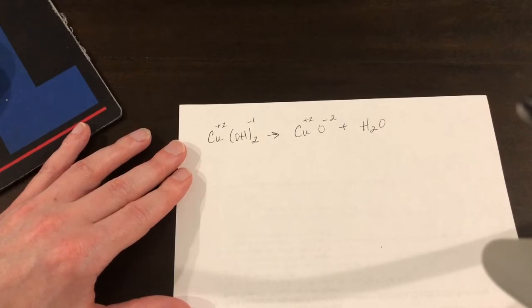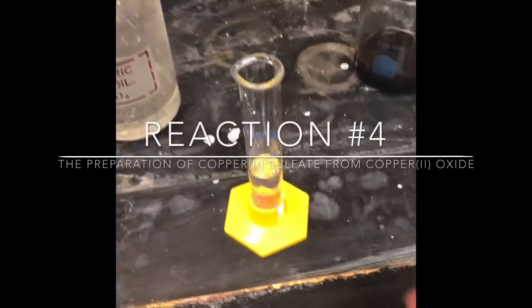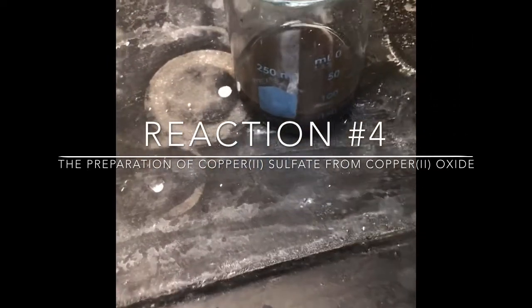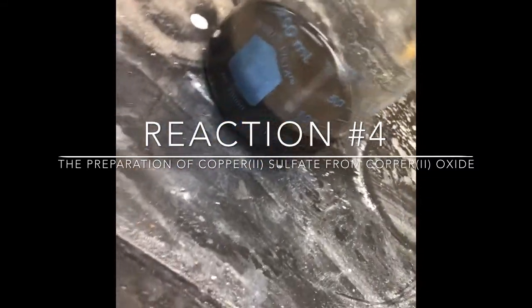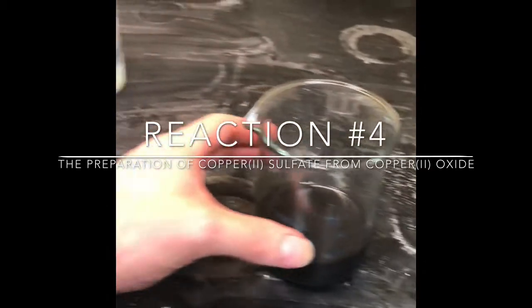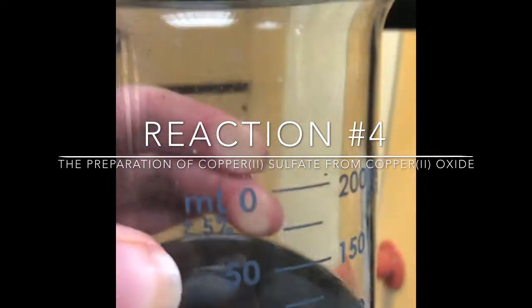On to reaction number 4, the formation of copper 2 sulfate from copper 2 oxide. The first step of the lab is we're going to add 15 milliliters of sulfuric acid to our solution. Okay, so let's watch what happens. So we're watching what's happening. This stupid thing keeps beeping. Okay, so not much happened there. It changed all back to that pretty blue, and so we have some copper left on the top. And that's our whole goal, is to recover all of that copper.